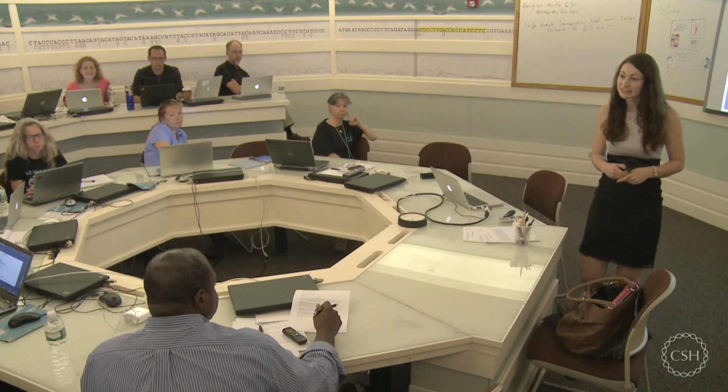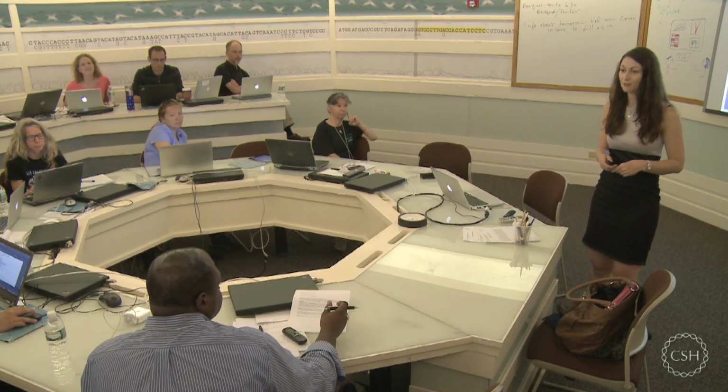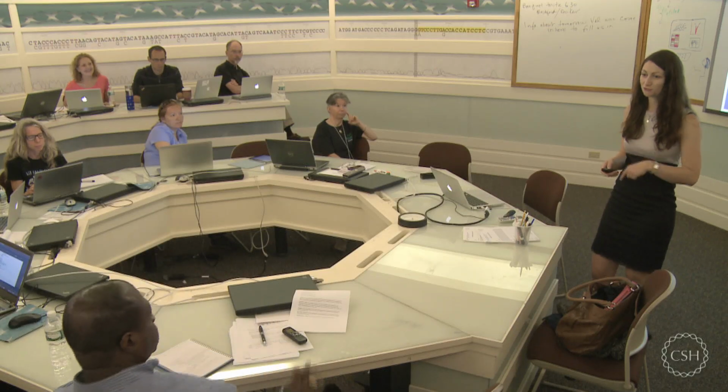You said GAPDH, but if you're working, how do you choose the control gene? I'm actually coming to that. Can I postpone it for a few slides?